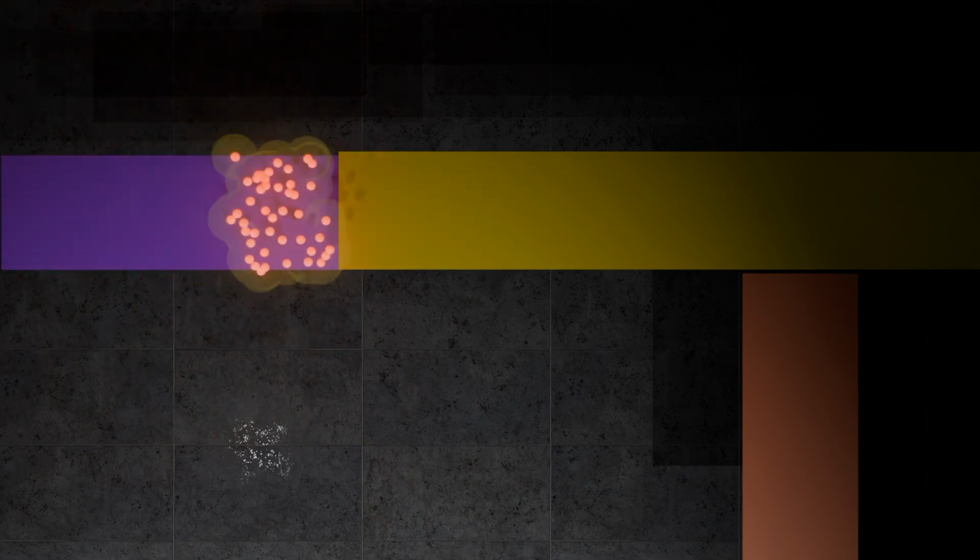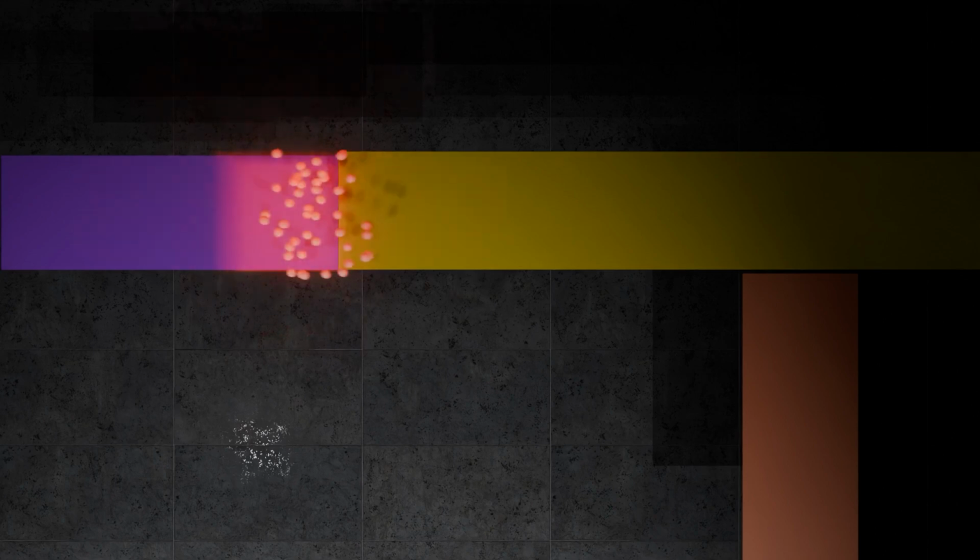So first, we start with our molecules as a gas. Then we turn that gas into plasma, which results in the molecules switching to ions. We need them to be ions because we want them to accelerate when an electric field is applied.